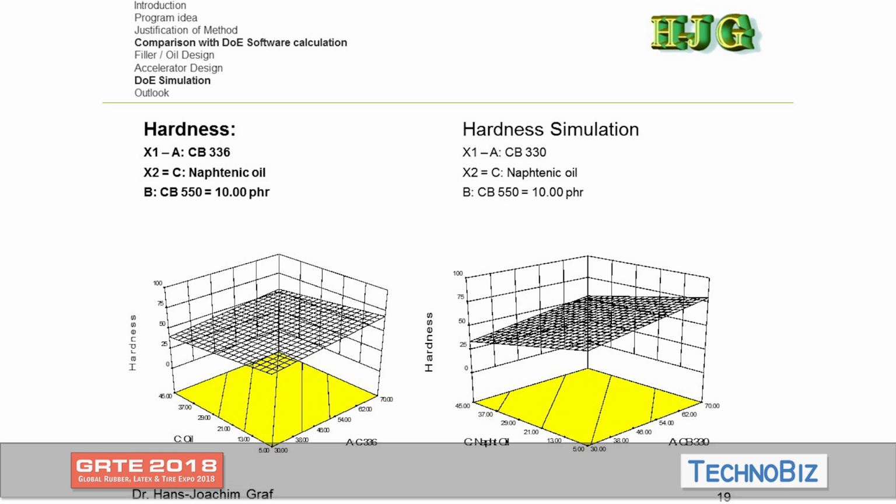Yeah, so this is using the historic database and actually using the similar database with the hardness simulation. And actually, I try to confirm this data with an experiment with the help of the Mahidol University here in Bangkok to get that also a real fresh experimentation to use that in comparison to this type of simulation.